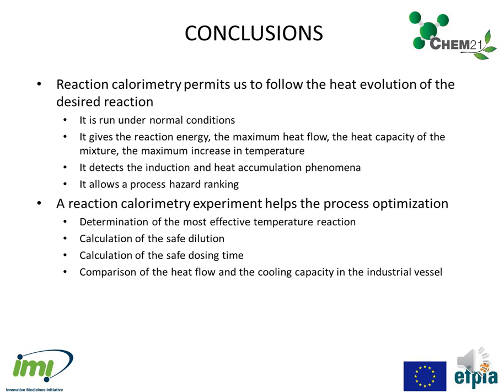Besides, a reaction calorimetry experiment helps the process optimization. It permits to establish the most effective reaction temperature without induction, to calculate the safe dilution and the safe dosing time, and to check if the heat flow is compatible with the cooling capacity of the industrial reactor.